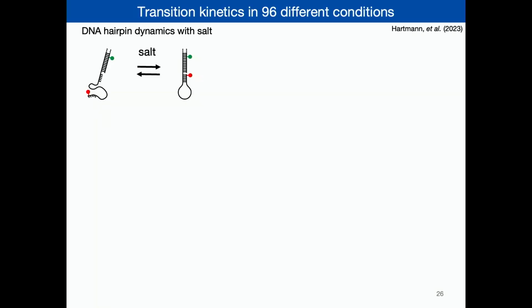So we were also interested in if we can measure kinetics with that on a molecular timescale. And the simplest system that we use there is a DNA hairpin-like structure that carries a donor and an acceptor fluorophore. And it anneals with 5 base pairs here in this case. So it is very transient, and we can influence that with salt, as we also learned in the previous talk.